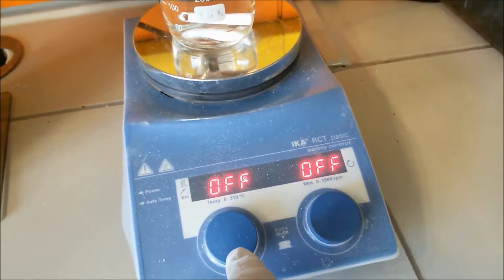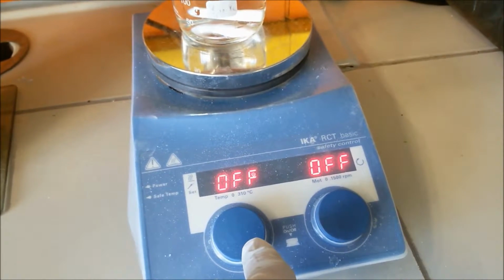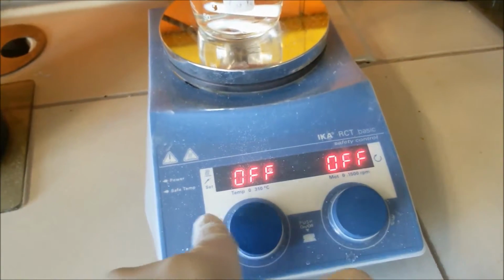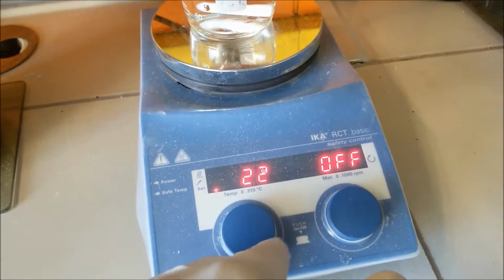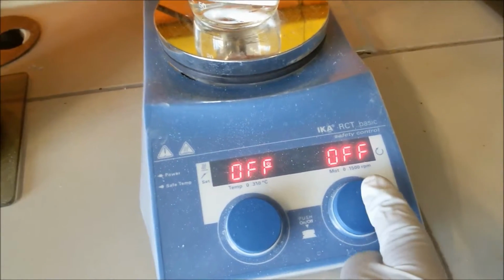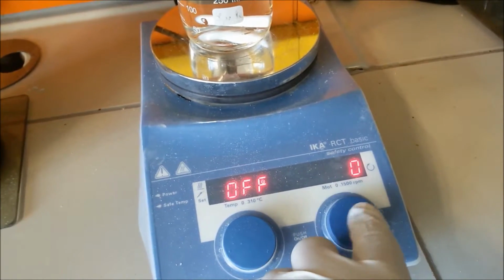So that means you can also adjust the temperature. We need the temperature because sometimes some chemicals do not dissolve at normal temperature, not in room temperature. So we have to increase the temperature. Let's say we have to warm them to 60 or 70 degrees, so we can use this. We don't need it now. And then there is RPM. So let's make it 0.